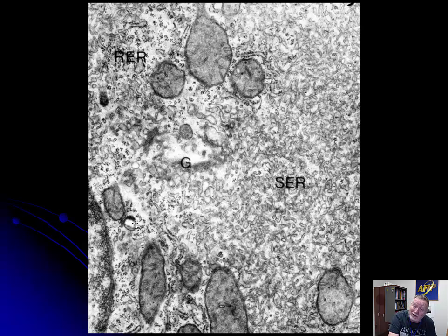Here's something that has some black, some white. Could it be a lysosome or phagolysosome? It could. I tend to try to stay away from trying to interpret this stuff. And I don't think that saying there are multiple electron dense structures, that red flag word, is helping us in our description. So I tend to leave this out. I stick with the stuff I can identify.